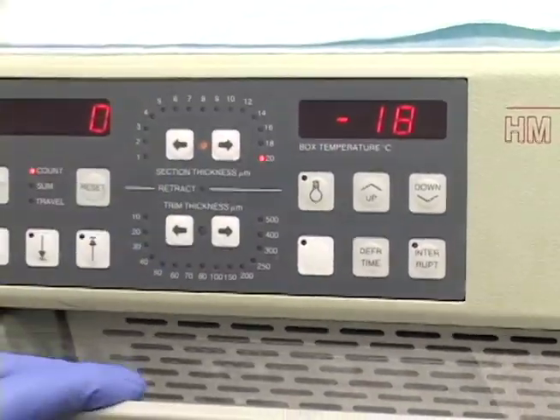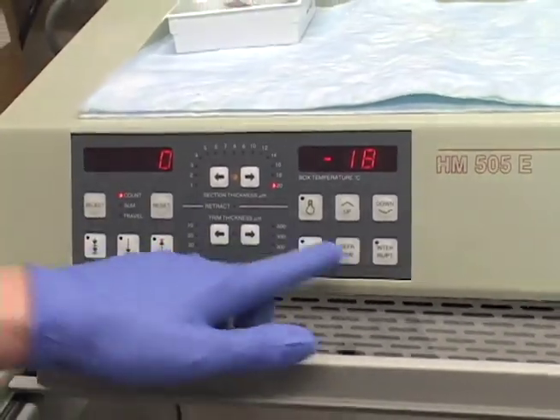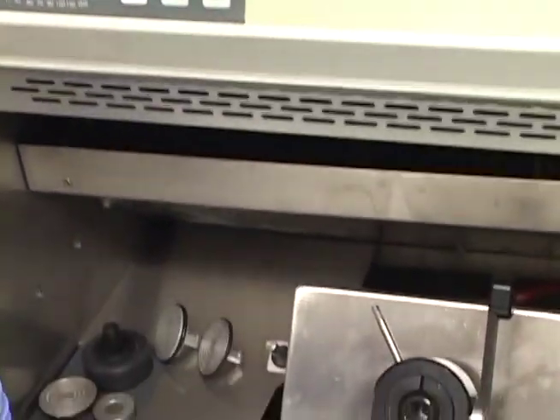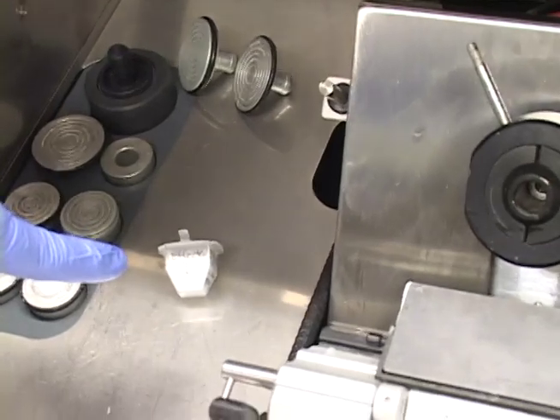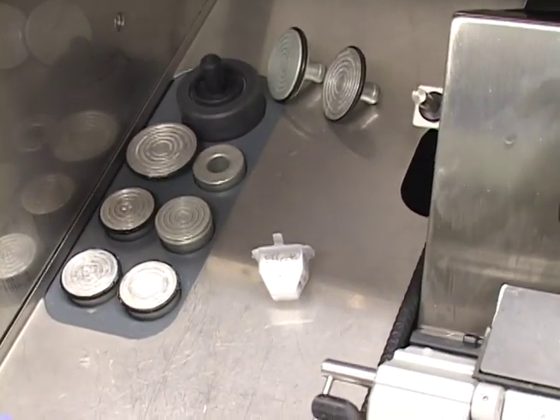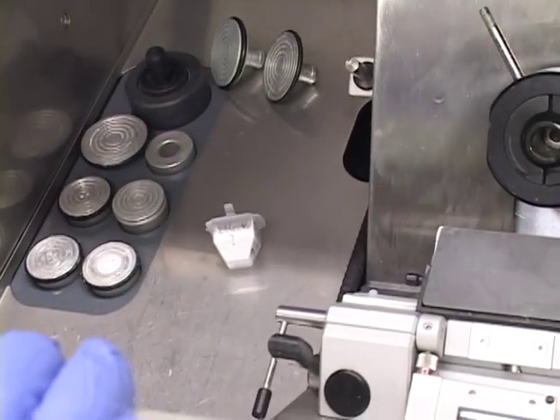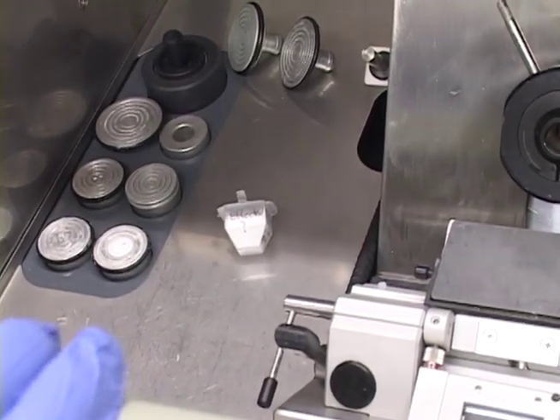It'll start going down to temperature. This microtome — you never want to leave a sample in it overnight, because it's preset to defrost at midnight every night, so it will damage your samples. Always take them out and store them separately.